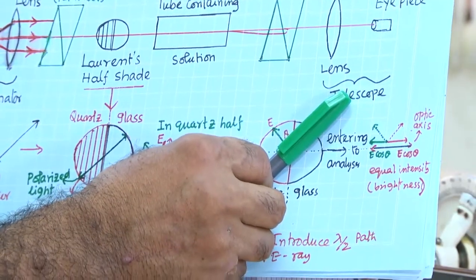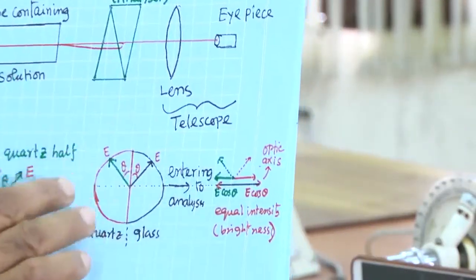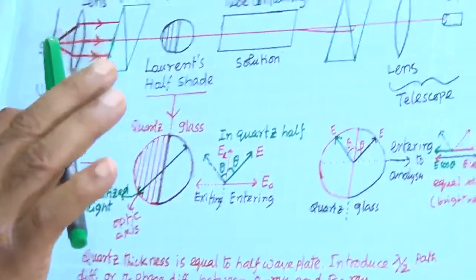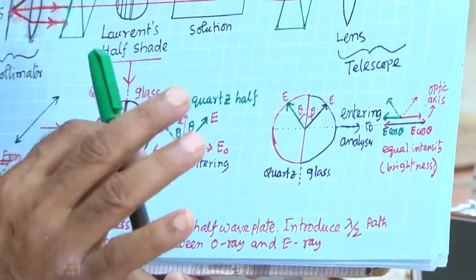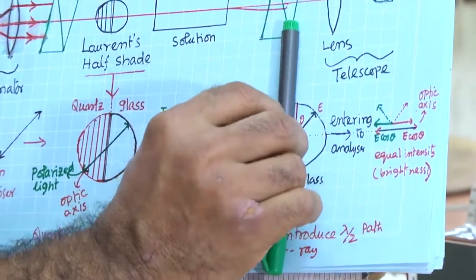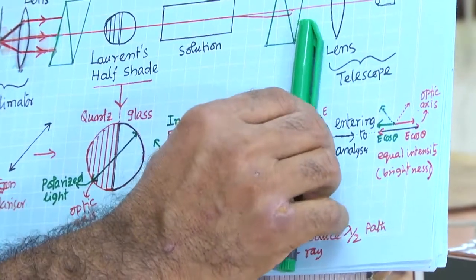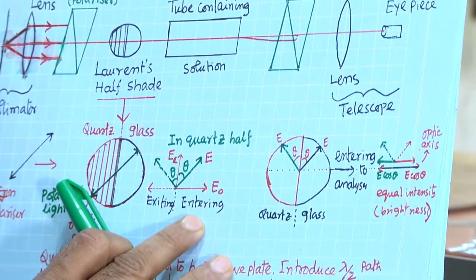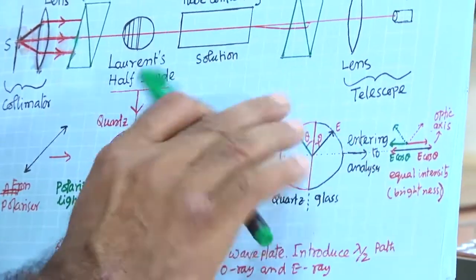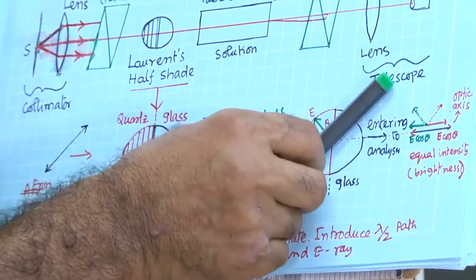So, I will come back to 360 degrees, which means the 0 position. So, in one complete rotation, I am getting 4 times uniform. One is this, second is this, third is this, fourth is this, from the uniform situation in both halves. And dark bright dark, this also we will get 4 times.